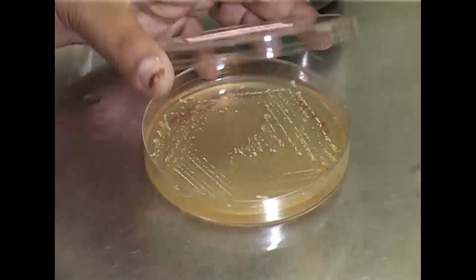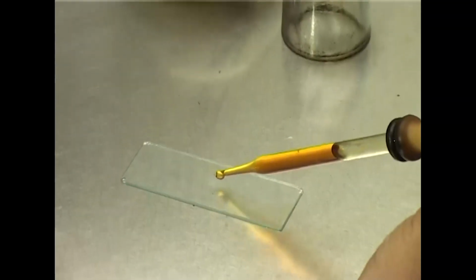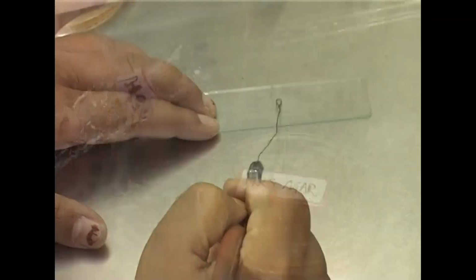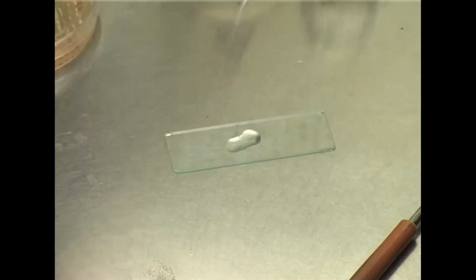First, the isolation of lactic acid bacteria. So, transfer from the MRS agar plate. By transfer, it will be taken for gram staining to characterize the nature of the colony. Next, the catalase test. To assay the catalase test, taking a loopful of colony over a slide, 3% H2O2 will be given. If it produces gas, it will be manifested as effervescence. So, it can be indicated whether it is catalase positive or not.